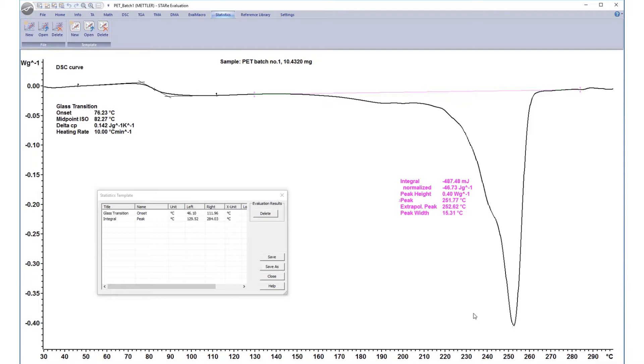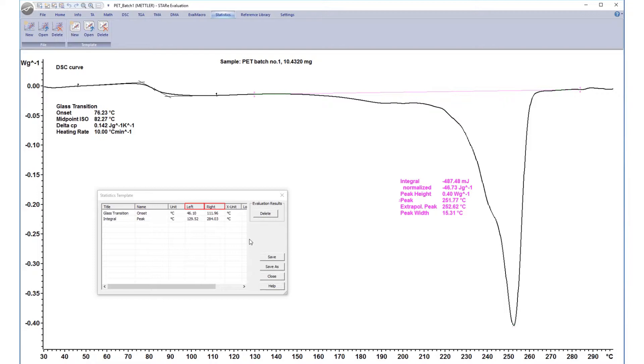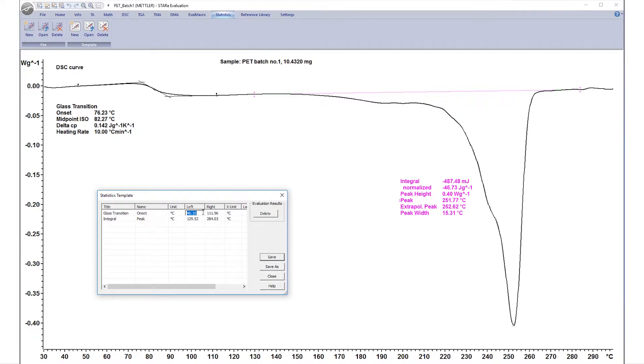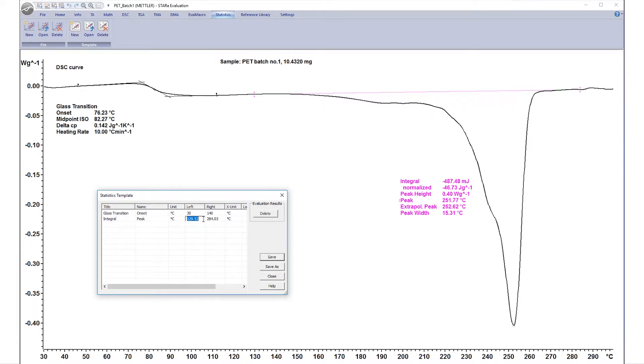To eliminate any effects caused by thermal history, left and right evaluation limits are also displayed which must be expanded to include future measurements with different temperature ranges. Following examination of the PET evaluation, useful limits for the PET sample exist in the glass transition range of 30 to 140 degrees Celsius and a melting enthalpy range of 100 to 300 degrees Celsius.